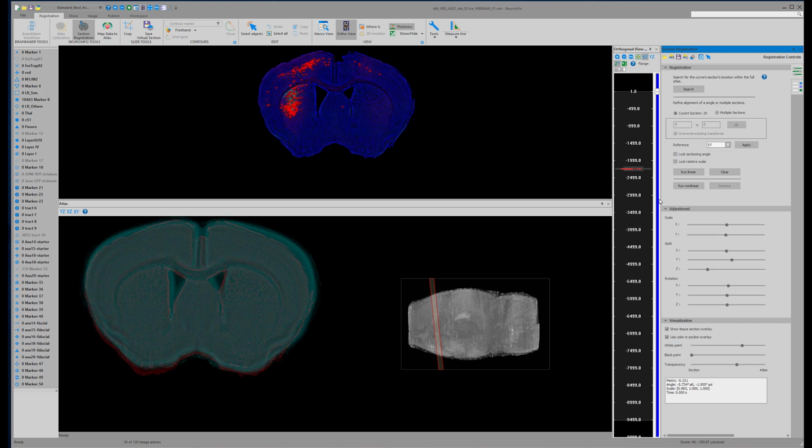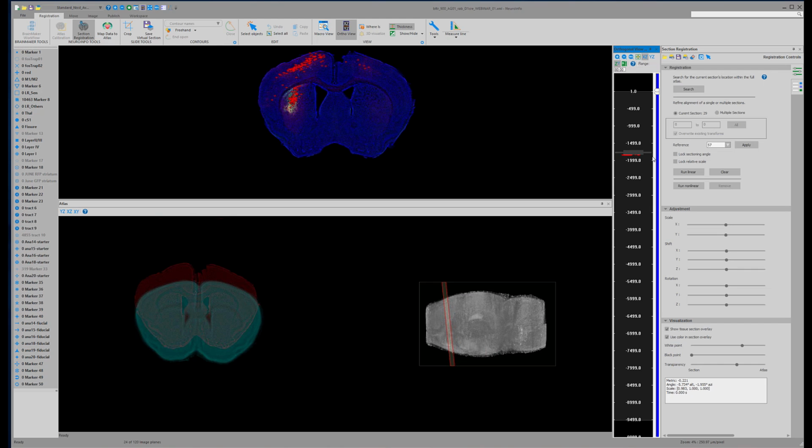Once we're satisfied that this offset is going to give us an accurate mapping, then we use that and march through the whole brain and have it do the registration. When we first looked and saw that it was displaced in the dorsal ventral axis, the program actually makes that adjustment.